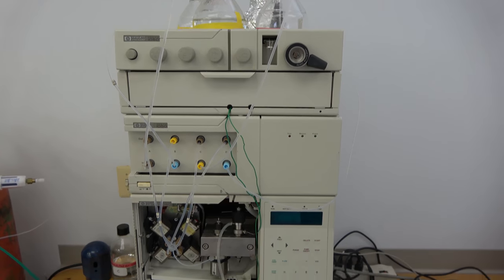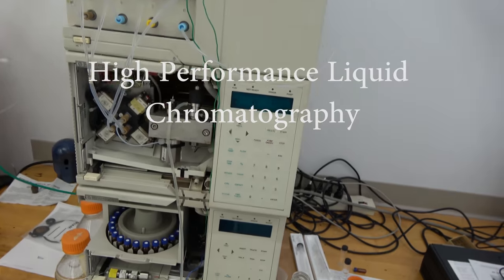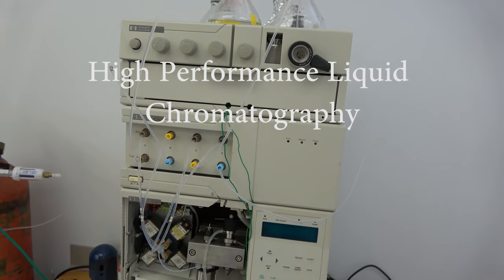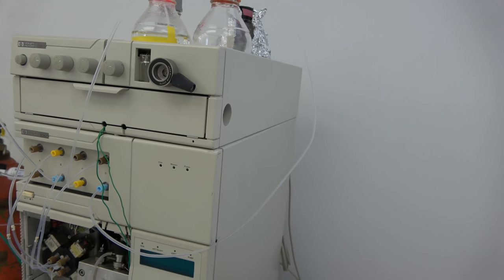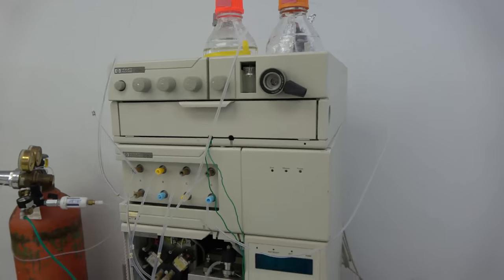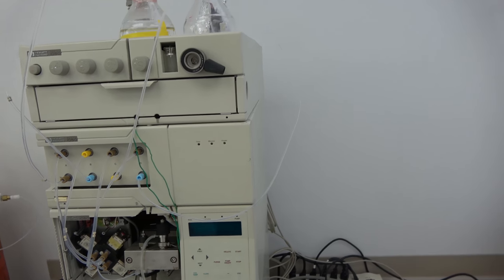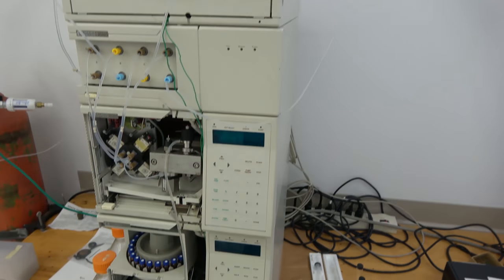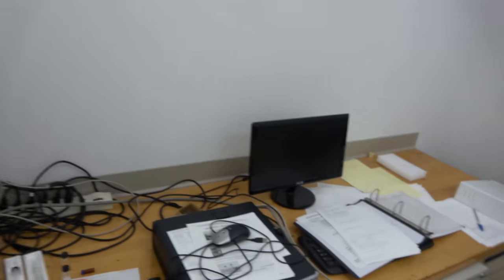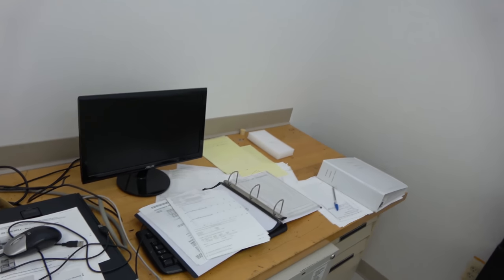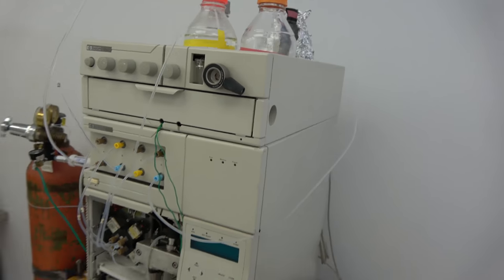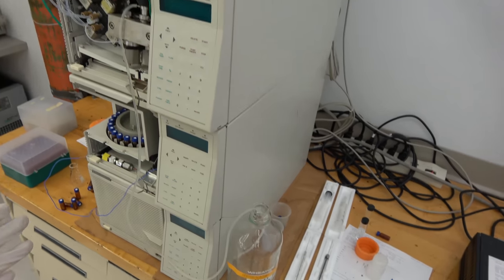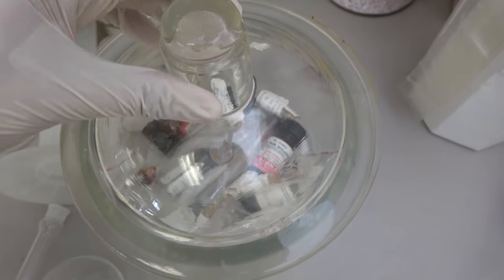This machine is called an HPLC. What this is is basically you analyze really tiny amounts of liquid. Just insane numbers. Insane analysis. You can get so much information. Downside is that this takes a while. You hook it up to a computer. Do all the computer stuff. I don't really have anything to do with this so whatever. But just so you know this is what a typical HPLC looks like.